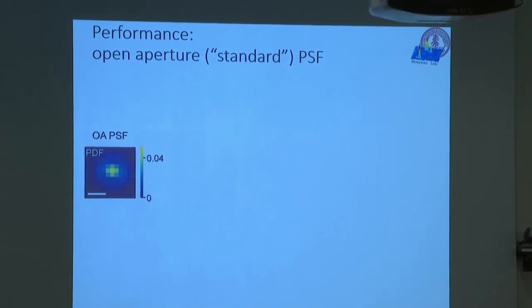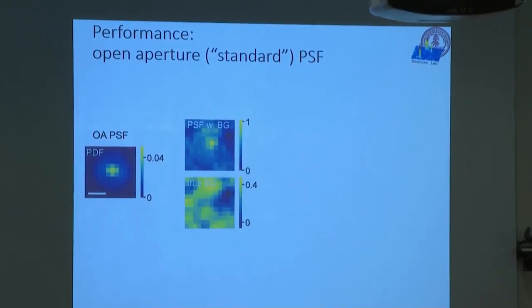So this is what a molecule is supposed to look like. But in fact, in a real measurement, you see it with background. You detect it with background. This is a simulation just to show you how well it works. This is the true background that was added to the PSF to make that image.